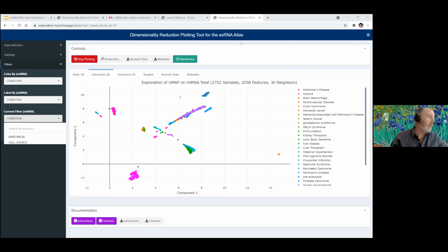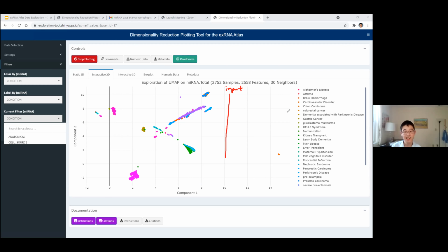And then Justin, the last question for you is, can you talk a bit more about the VAE architecture? Sure. This one currently has 3 hidden layers, and depending on the number of samples, it's essentially a geometric progression. You can imagine this is your input, and then the variational autoencoder is trying to reconstruct an output.